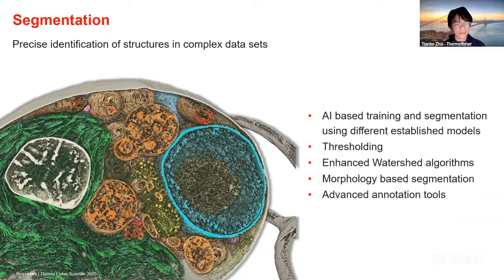If we can find a good criterion, for example, every voxel has a different intensity value embedded in it, and if we can find a magic range where the structure of interest happens to fall under that intensity value range, then we can complete the classification task.